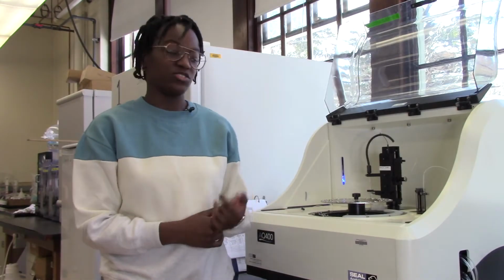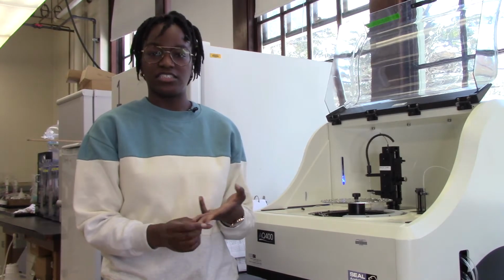At the LLO, the way we perform spectrophotometry is using the SEAL AQ400. This is a fully automated analyzer. So we pour up water or a prepared plant, zooplankton, or sediment sample. We fill different wedges with reagents, and we select a program to run. We measure different kinds of analytes using the AQ400. So anything from phosphorus, silica, to nitrates, and there are about 30 different analytes that we can analyze and measure using this machine.